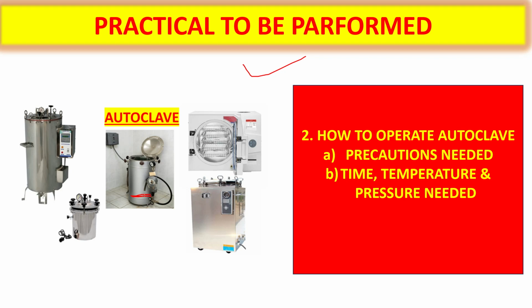Okay, next you have to wrap all the materials which you put in this autoclave, that means microbiological media or reagents or solutions. And if there is a bottle with a screw cap, you have to loosen the cap and put it into the autoclave.